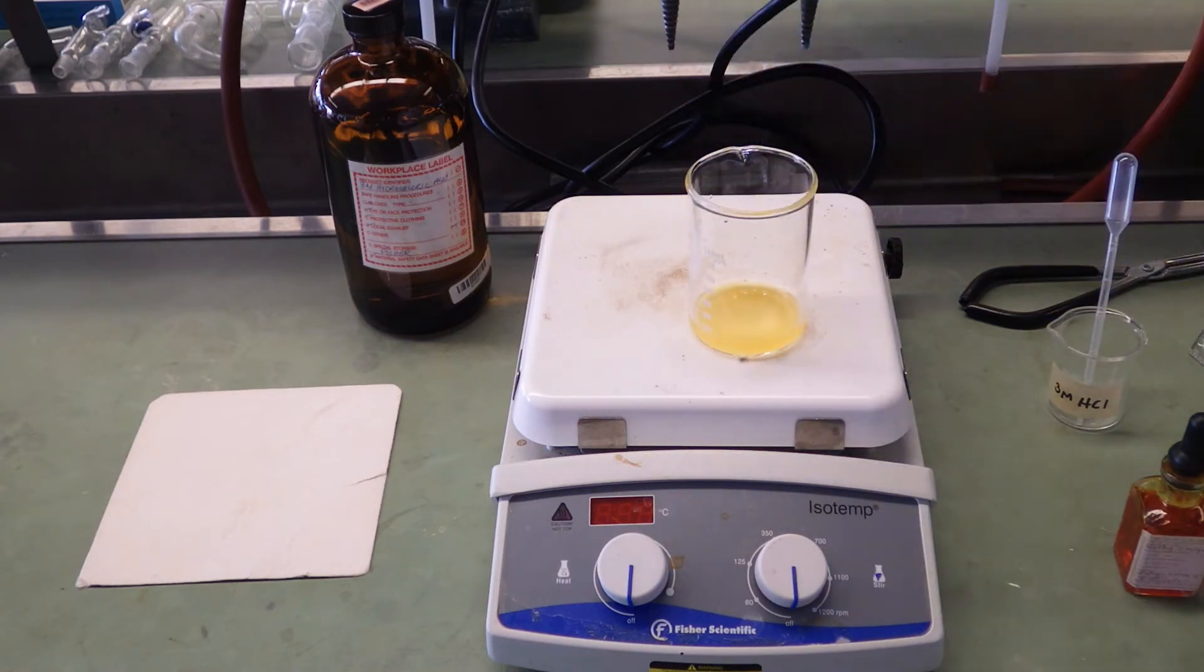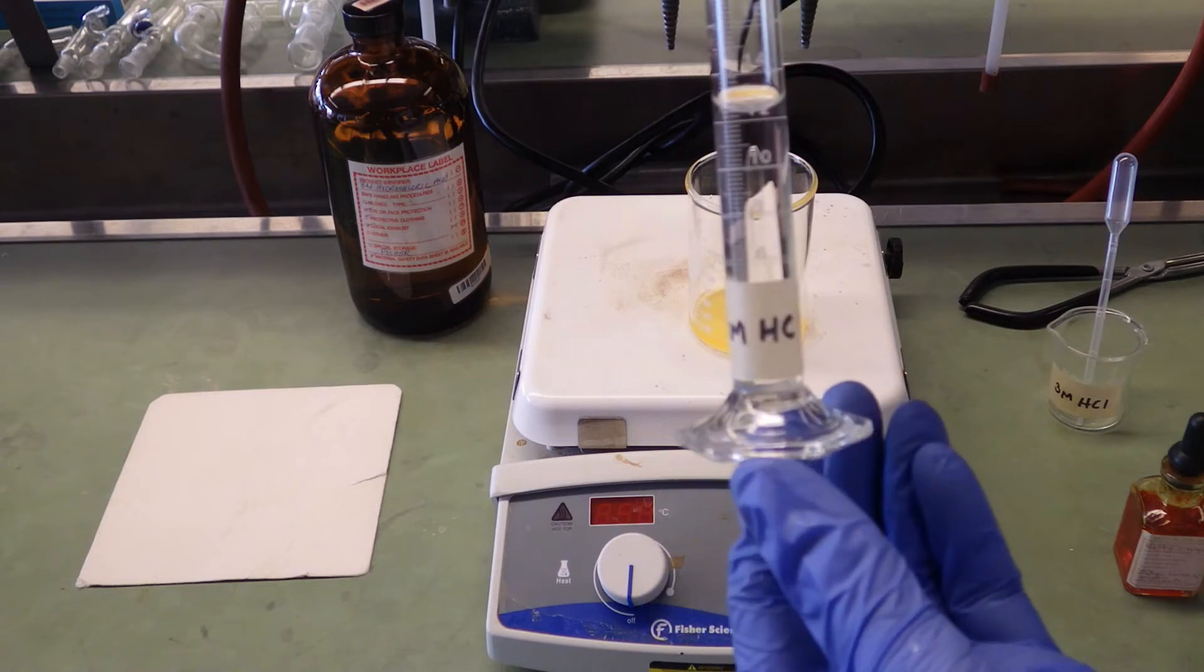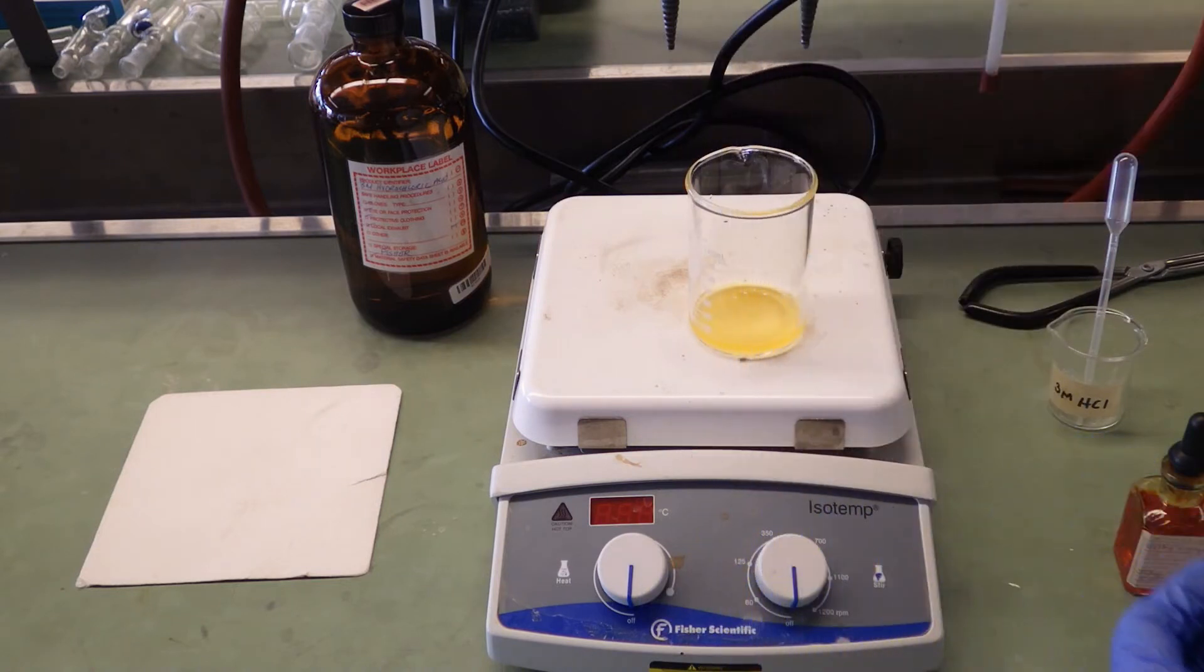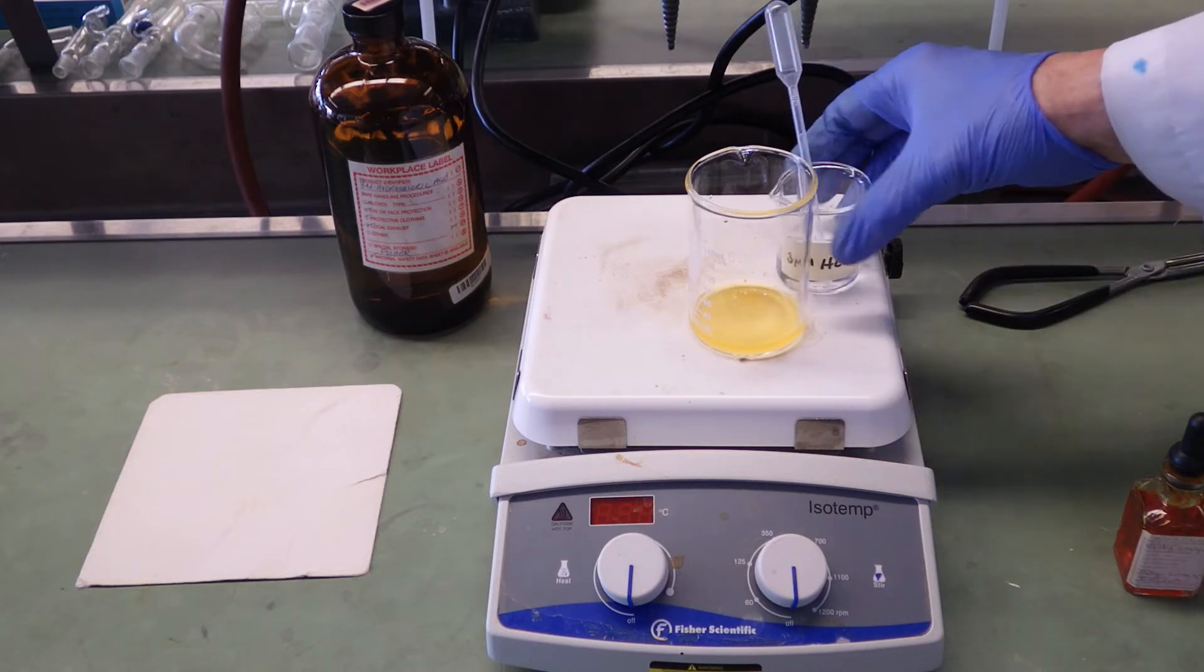There's the yellow color, indicative of a base. Here's 3 molar HCl. I'm going to add 12 mils. It should be in excess, enough to neutralize all the sodium bicarbonate.